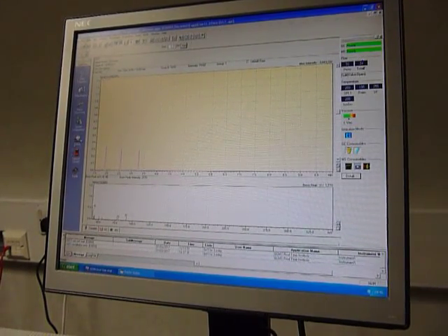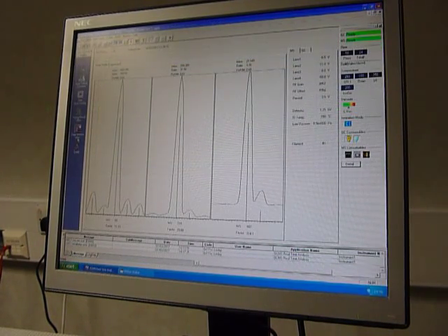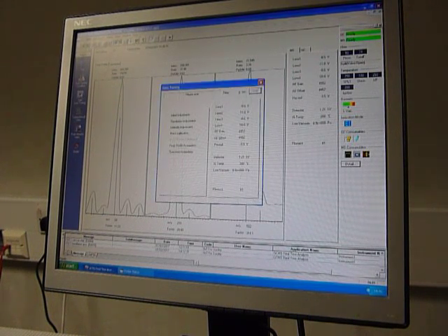It's quite easy to tune this instrument. I'm going to use the tuning button there. Basically, it tunes on a compound called perfluorotributylamine, which has a molecular weight of 671. We'll start the auto-tuning now.